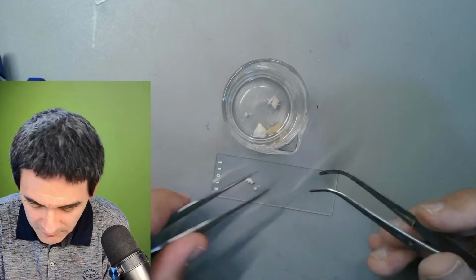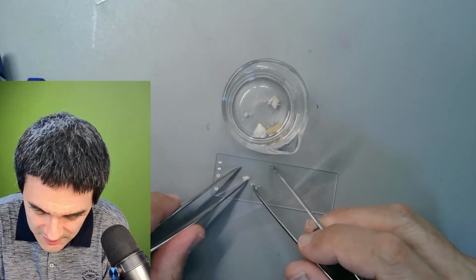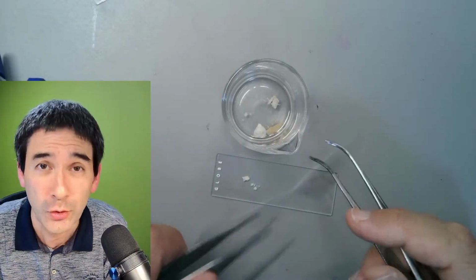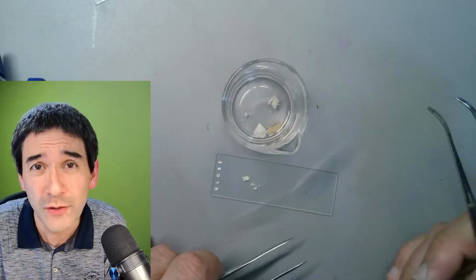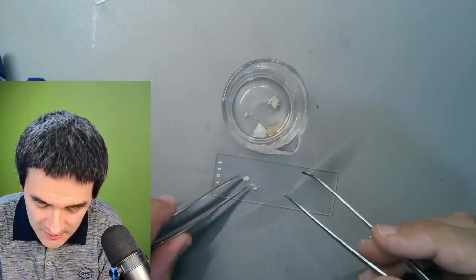So a very small amount we need. However, the thing that did disturb me a little bit is not some kind of weird microbes, of course not, but the fact that I actually found microplastics in them. And that's something I would say is more interesting.